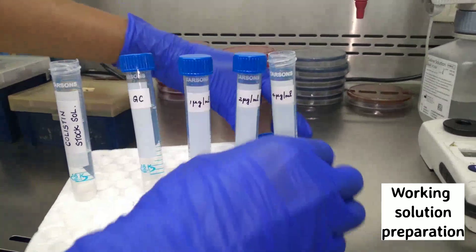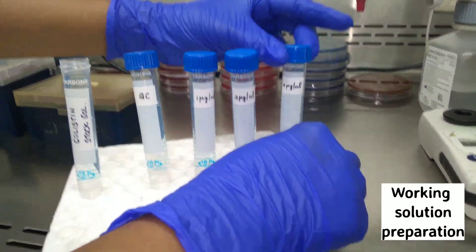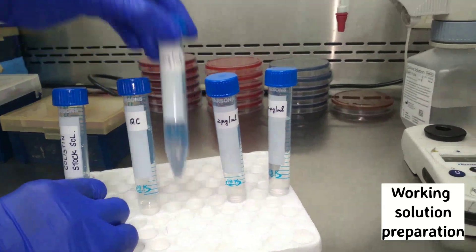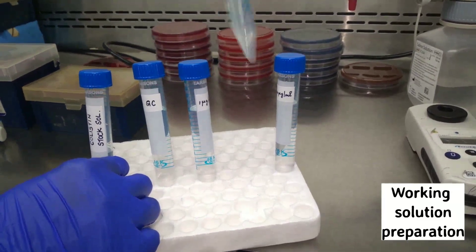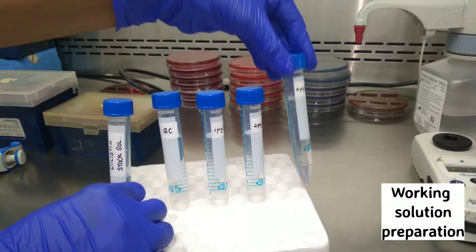Shake all the tubes well so that the colistin stock solution thoroughly mixes with the sterile water. The growth control will not contain colistin, whereas the other tubes will contain colistin in different concentrations.